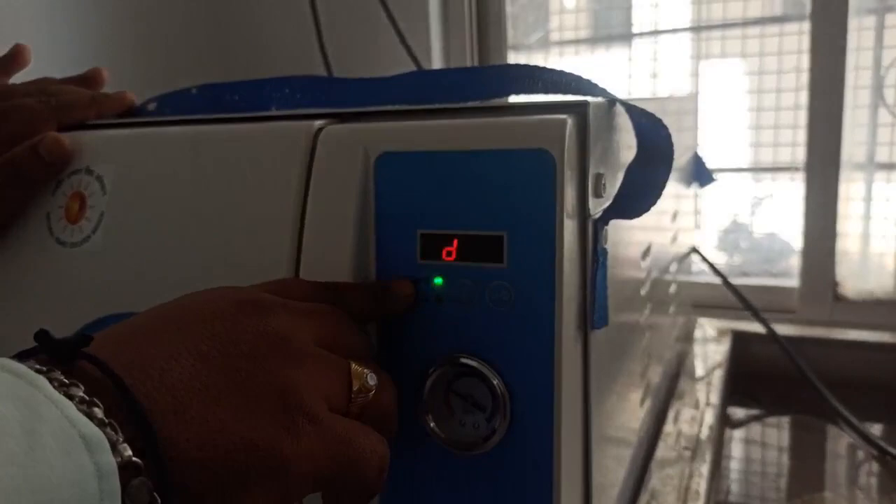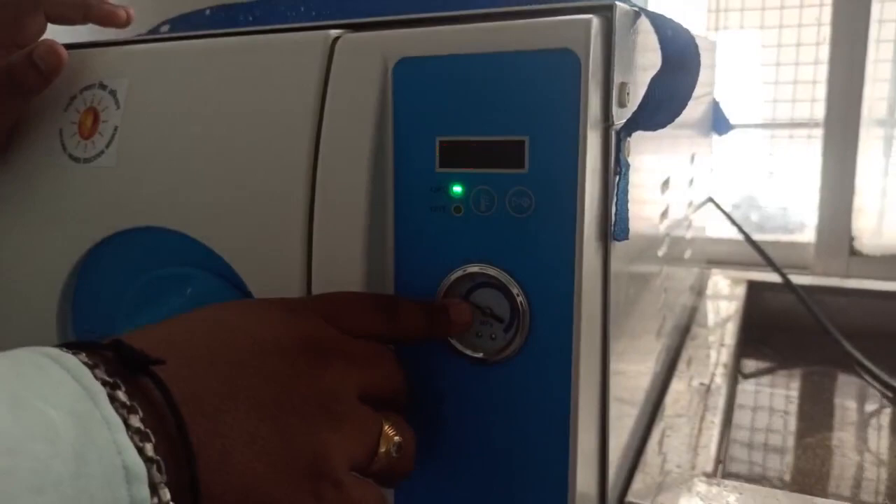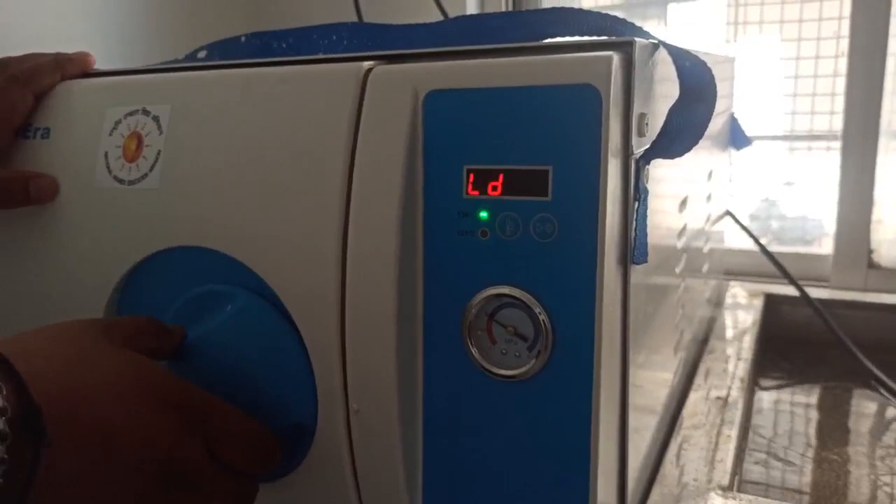Here the digital analogue shows you the pressure. Once the autoclaving is done, it gives an alarm indicating that autoclaving is complete, and then you have to switch it off.